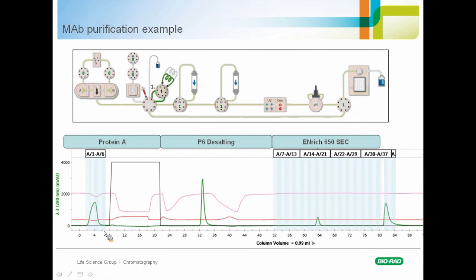So again, we see the same chromatogram on the top part of the screen here. And what I'm showing highlighted on the bottom part of the screen here is just the peak from the size exclusion column. So what we see here on the right that I'm showing with my cursor are the 3 monomer peaks. These are 3 separate runs overlaid at the result after the sample is passed over the 3rd column. So you see, even after running the sample over multiple columns and doing this multiple times, this is a very reproducible technique.